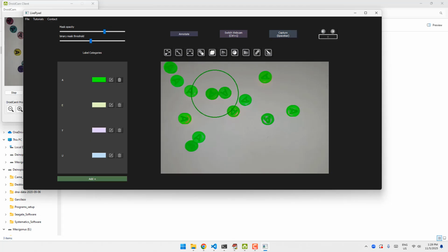I'm gonna introduce some manual annotations once the annotation has been completed. I'm simply gonna annotate the center in here myself, which is something that I suspect I could have avoided with better illumination, but we work with what we have.